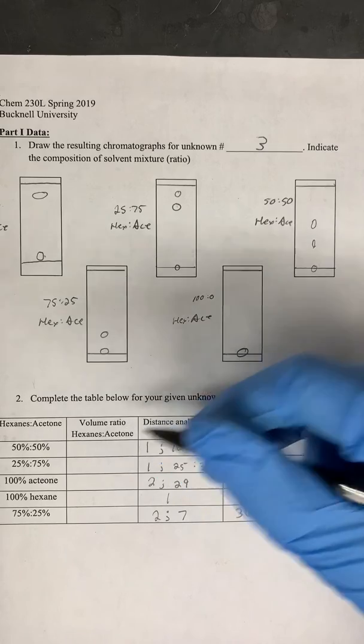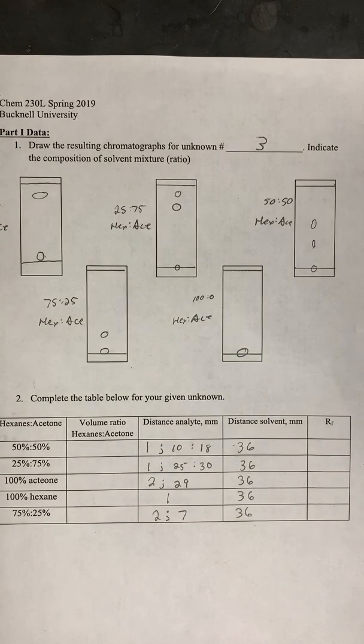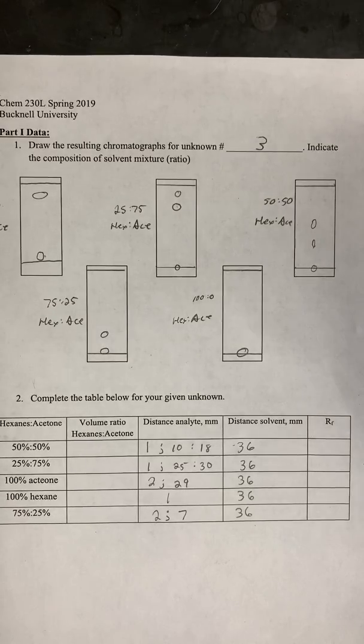And also you need to fill in the volume ratio for each of the runs to determine how much volume of each solvent you'd be adding from your micropipettor to make that solvent ratio, keeping in mind that the total volume in the solvent chamber for the five different vials was 0.5 milliliters.